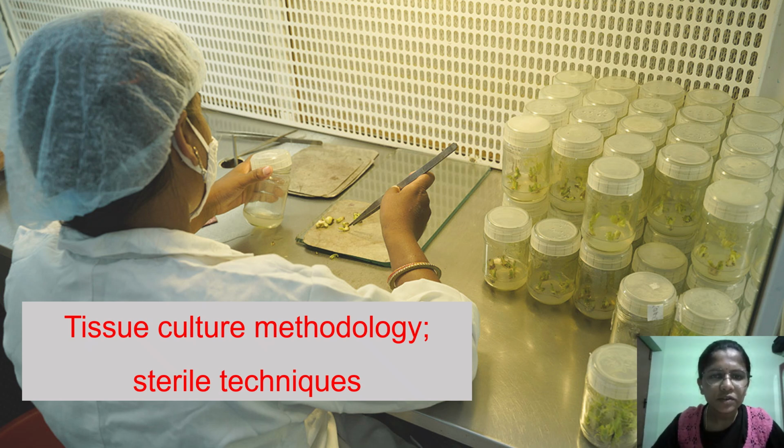Hi, dear students. As a part of your micropropagation technologies, you will be learning in this particular lecture various tissue culture methodologies and also how to follow the sterile techniques. In the previous classes, you have already studied the very basic things like how to maintain the aseptic culture, why we should go for maintaining it, and how it is directly related to achieving successful tissue culture plantlets production.